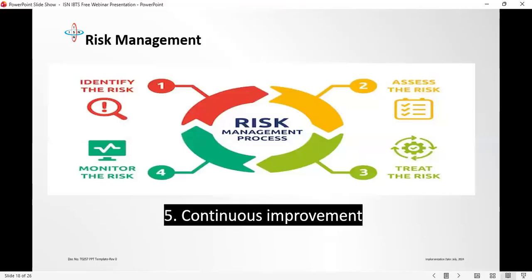Risk management is what the ISO 15189 is about. This thing that I am about to do, what are the inherent risks in pre-analytical? From misidentified patient, wrong sample labeling, to entering a wrong result, transcription error, to running a wrong control level or running a wrong sample.